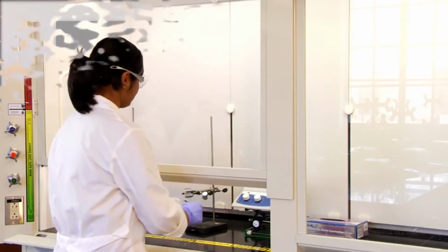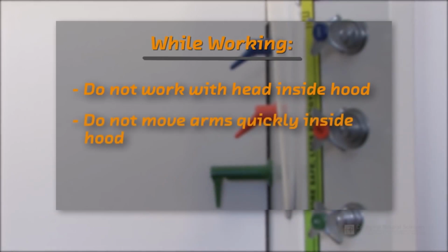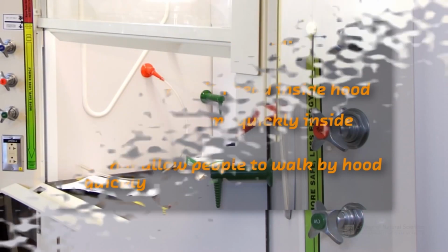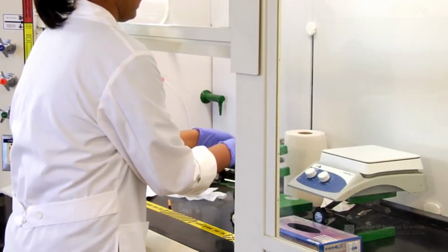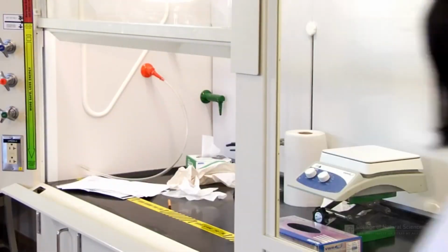You should never work with your head inside the hood. Also, do not move your arms quickly inside the hood while you are working. Even people walking by quickly can disrupt the airflow. Keep the hood clean and avoid storing items in the fume hood. Every item in the hood can create turbulence, which can reduce the effectiveness of the hood. Only keep the items necessary for your work in the hood and promptly clean up small spills.